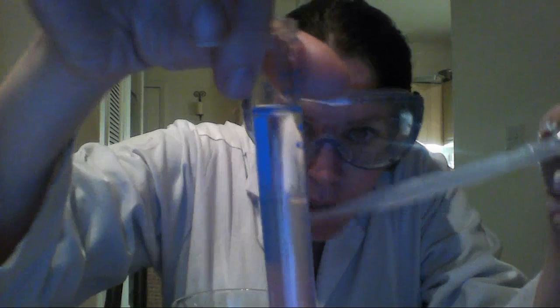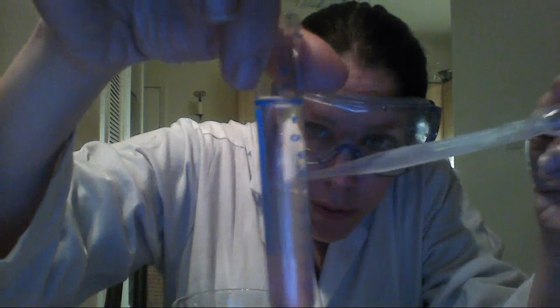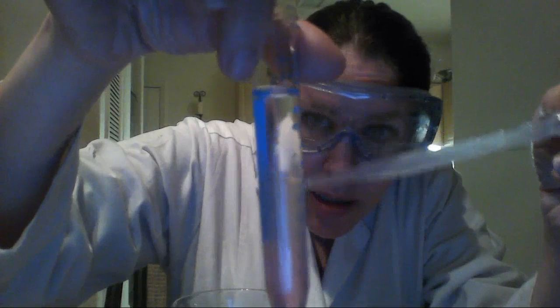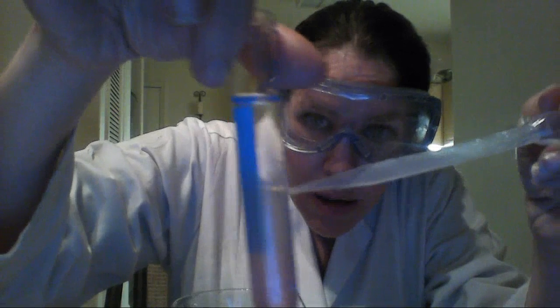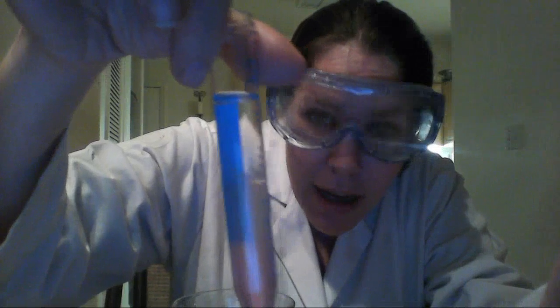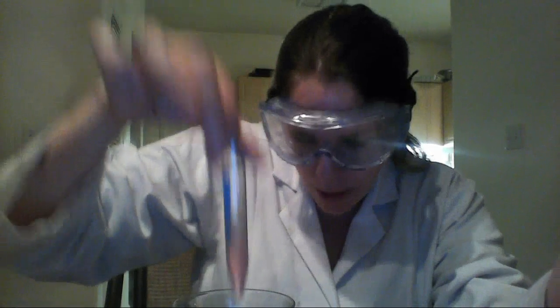I can already see in mine right at the barrier, the border between the ethanol, which is sitting at the top, and the rest of the solution, which is at the bottom, you start to see webby, stringy stuff. That is pure DNA, and that's what we're going for. But again, don't mix this up yet.